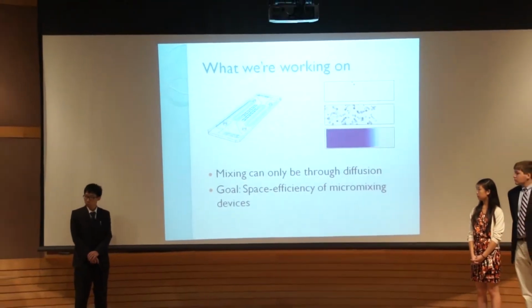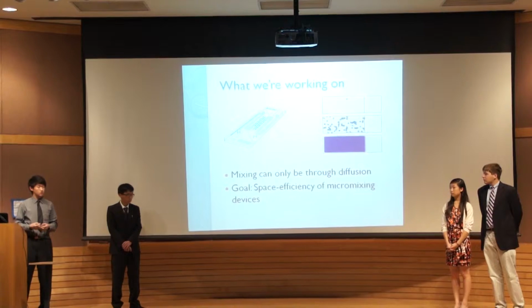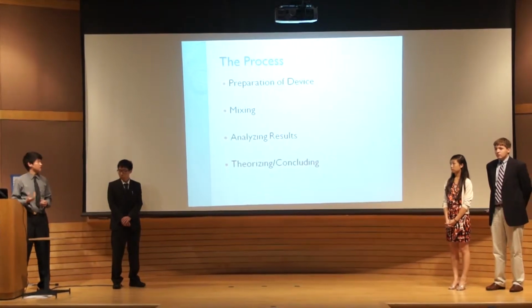Our overall goal is to analyze the properties of mixing within a microfluidic device, and then use these properties to determine which device is most space efficient, which device can mix best while taking up the least amount of space.